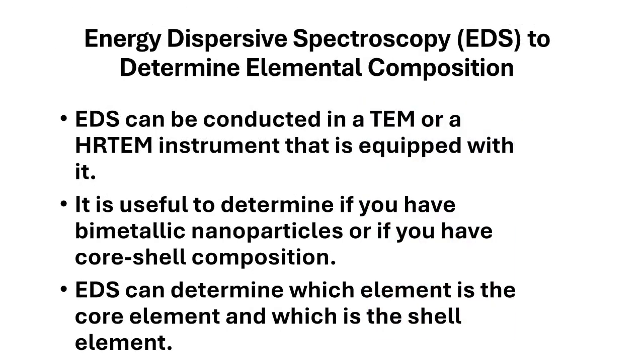Energy dispersive spectroscopy, EDS, is a tool available on a TEM or a SEM which allows one to obtain the elemental mapping information. EDS works by detecting X-rays emitted from a sample when it is bombarded by a focused electron beam. High-energy electrons from the TEM or SEM strike atoms in the sample. Then, an incident electron ejects an inner shell electron from an atom from the K or L level.